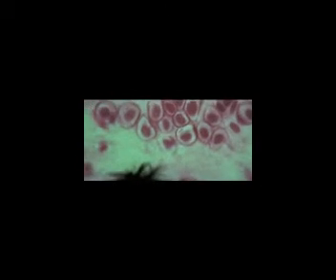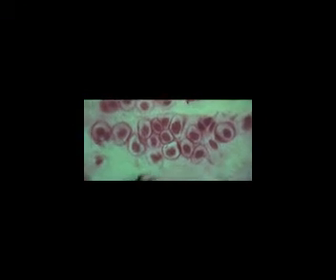Notice that these pink things that wave through there are collagen. The function of fibrocartilage is strength. This was an example, intervertebral discs. What were the other two? Pubic symphysis and meniscus of the knee.